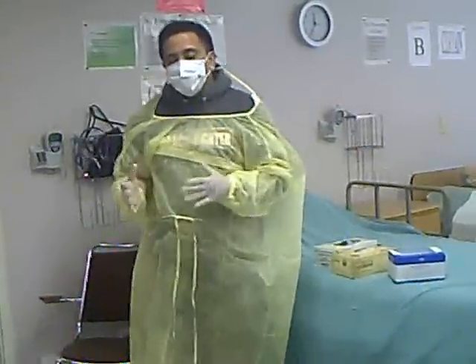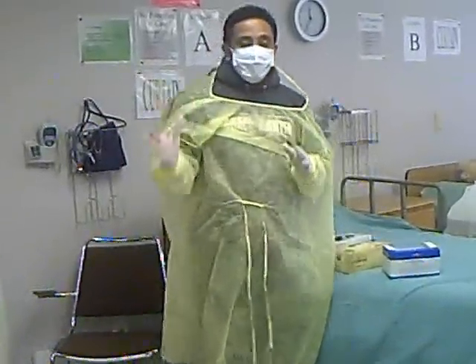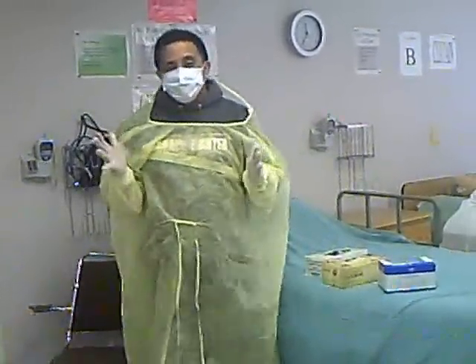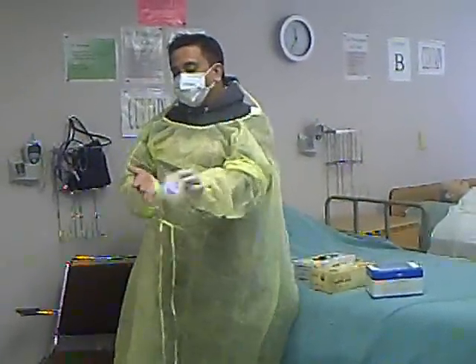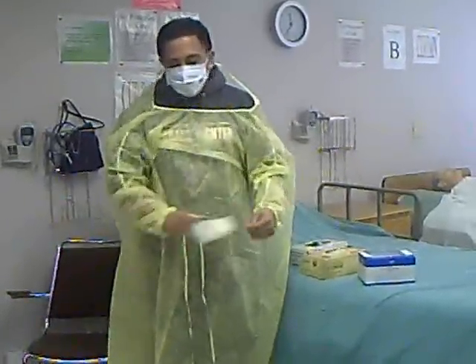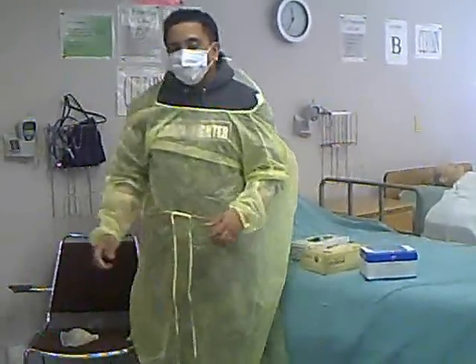After that, you do the skill — you go inside the patient's room and then you do the skill. When you're done, before you step out of the room, remove the gloves first. Look at how to remove them: one finger right here. Throw them in the red bag — not the garbage, the red bag.